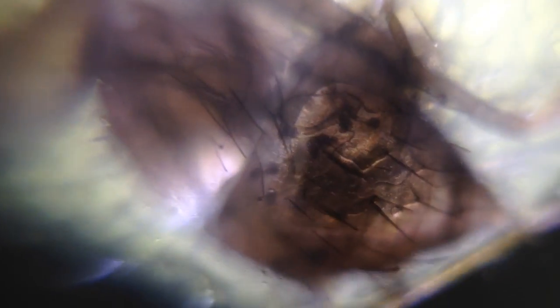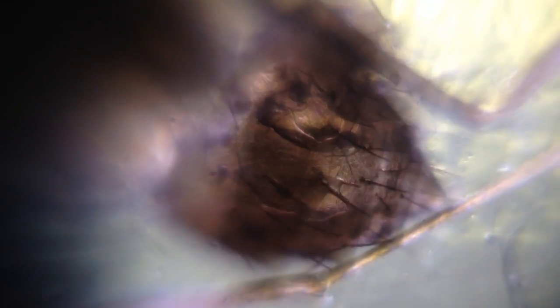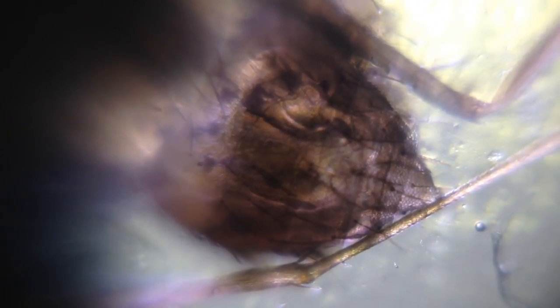Uh oh, it seems like it's kind of turning. Moving down to its abdomen and the incredible thing is you can actually kind of see through it. You can see the hairs on its abdomen.